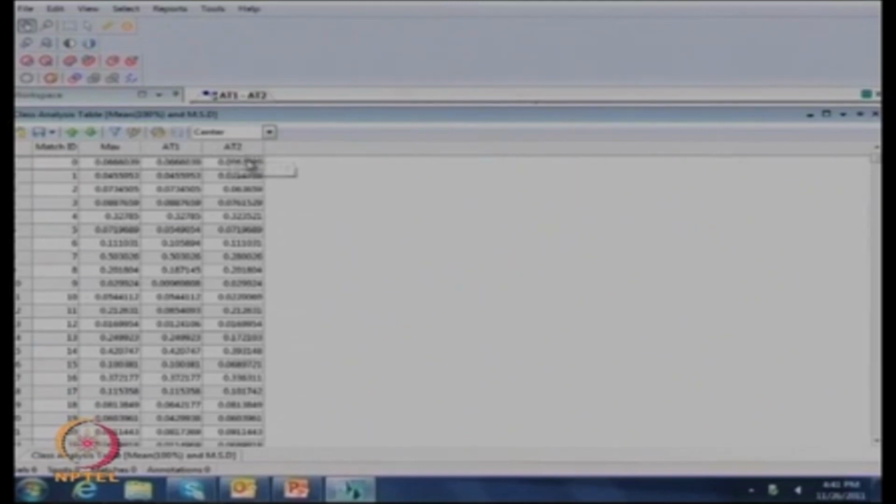Okay, so for the control and treatment, both groups we had 6 gels, right? Yes. So what are the values in each of the 6 gels for each spot? For each spot, exactly. This is the averaged value again, the average of all the 3 gels from each group. Yeah. If you can see, this is the ratio value which is giving the upregulation or downregulation.